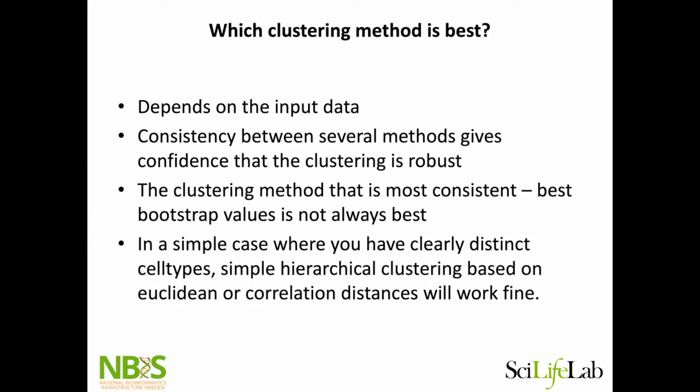And then, of course, hierarchical clustering and so on, or k-means clustering, works really well if you have a very simple data set, if you only have 2 cell types or 3 cell types in your data set. But when you're starting with bigger projects where you have a tissue with 10 or 20 different cell types in them, it's really hard to represent the relationship between all these different cell types without using graphs, basically.